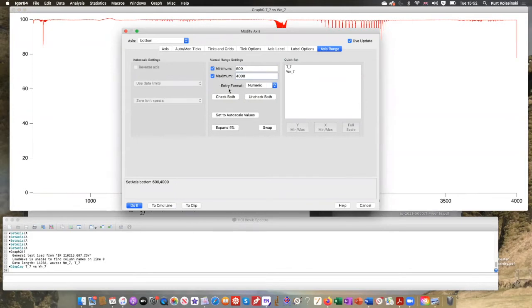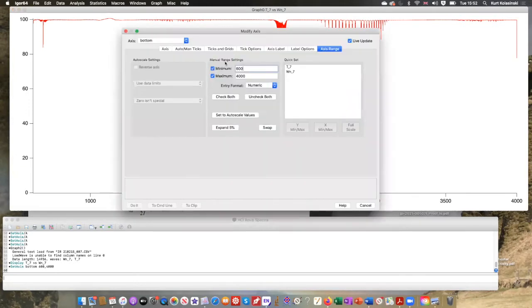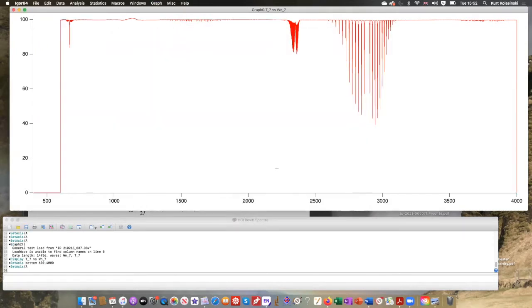Now, another thing that happens actually, right, is that right now we've got the low energy side down here and the high energy side up there, but we actually normally get it the other way around, right? When we do, I'll just auto scale that. We normally go the other way around when the spectroscopic notation is have the low energy red side over here and the high energy blue side over there.